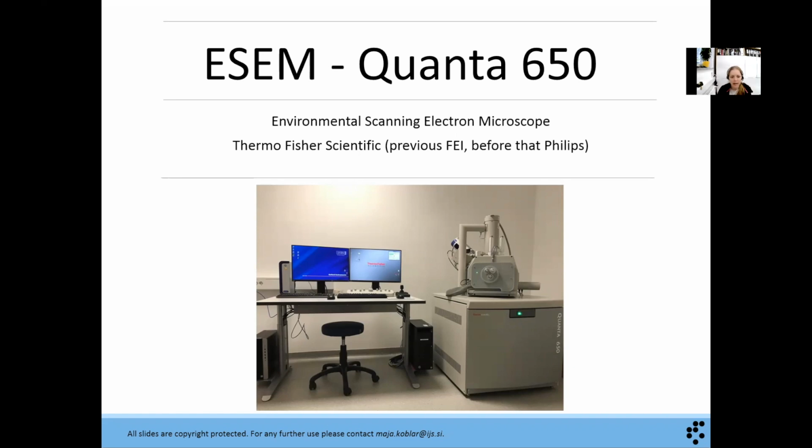My name is Maya, and I work in the Center for Electron Microscopy and Microanalysis. Today I'm going to talk about the environmental scanning electron microscope from Thermo Fisher, which was previously FEI and even before that Philips.